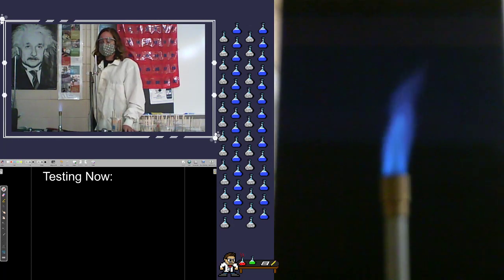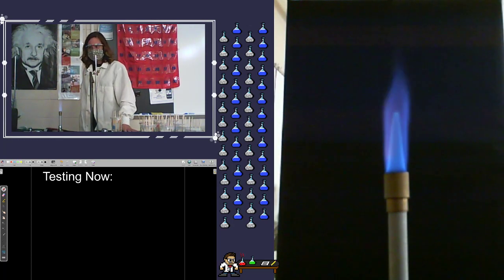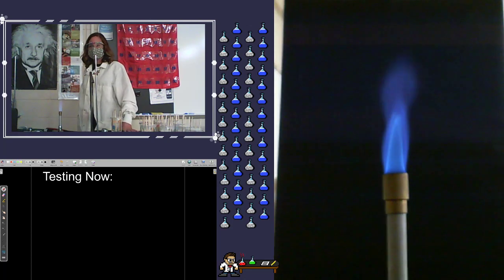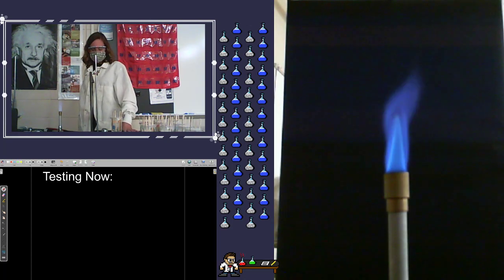Hey, how's it going everybody? Today we're going to be doing a classic chemistry lab experiment here, the flame test lab.